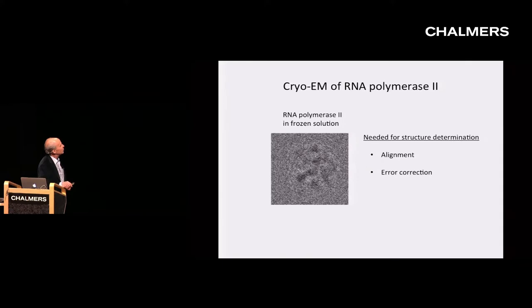It will be apparent to you, or many of you are doubtless aware, that averaging is accomplished almost automatically when one performs a diffraction analysis, either X-ray or electron diffraction analysis. But it must be performed, as it were, manually for cryo-electron microscopy, because in most cases one is not recording images of crystals but of individual molecules, and they are randomly oriented when observed in solution.